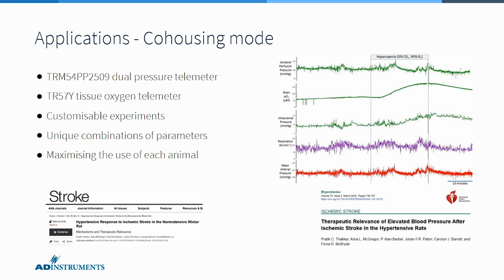And again, these are really interesting papers to go and read about the blood pressure after stroke in rats, and some therapeutic approaches as well. And really, again, showcasing the use of the telemetry system.